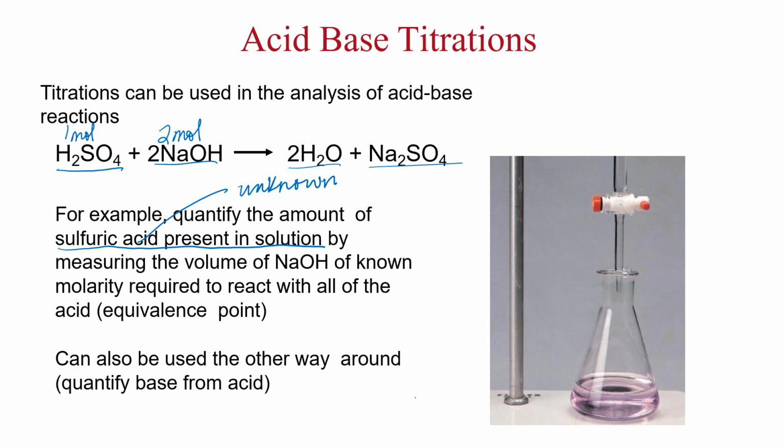So this time, sulfuric acid is our unknown concentration. And the NaOH that we're dispensing through the burette into the sulfuric acid is actually of a known molarity. Now you might be wondering, how can we quantify exactly the molarity of sulfuric acid in this solution by doing this? Well, trust me, by the end of this video, you're going to know. It should hopefully make a certain amount of sense to you because we have numbers we can play around with here. But I'm definitely going to show you specifically how this works.